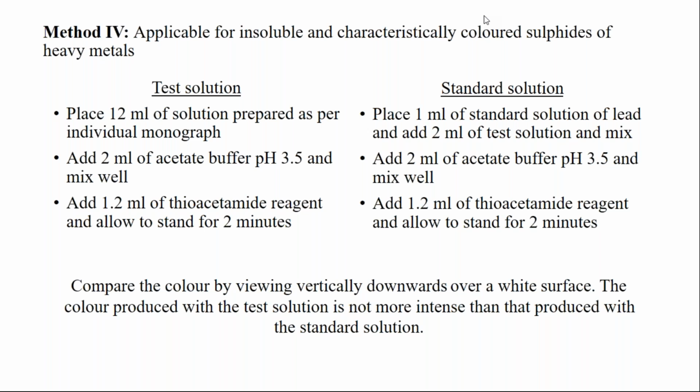Okay. Yes, so now coming back to this, tell me what is the difference that you saw between methods 1, 2, 3 when you compare it to your method 4? Ma'am, we are using thioacetamide reagent and acetate buffer of pH 3.5.